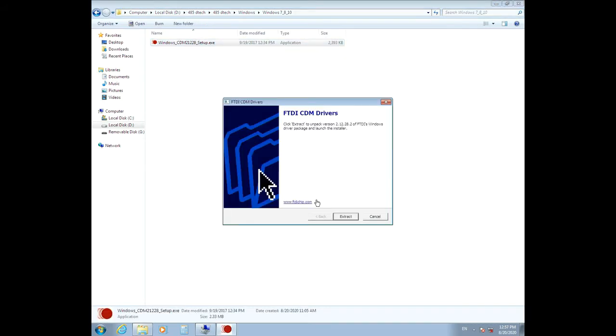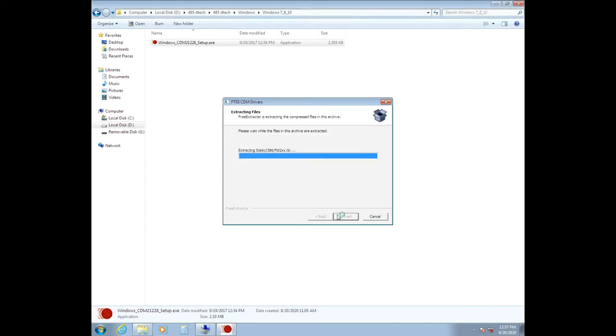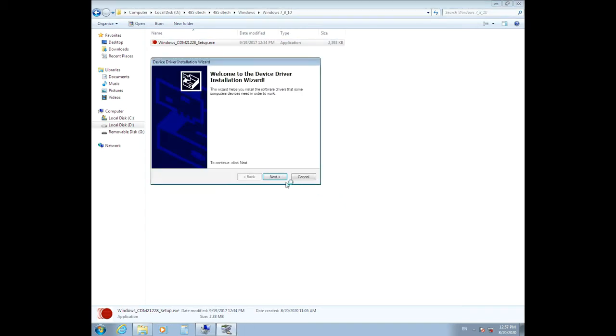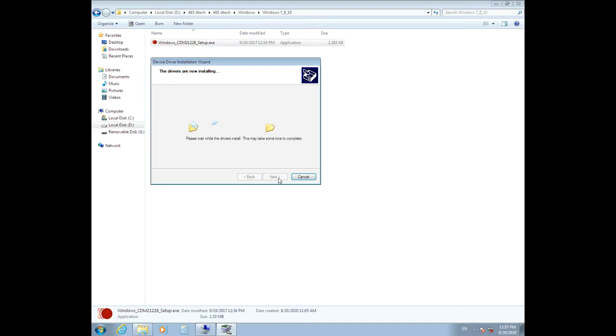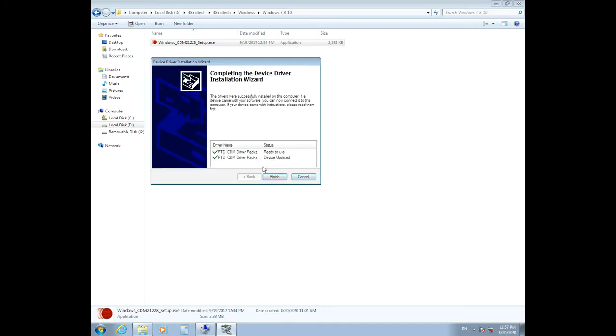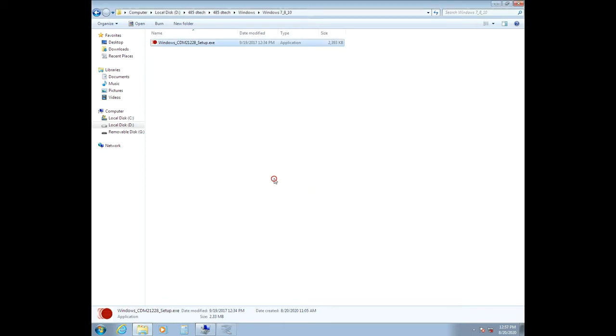Install the program easily. That's it. Your converter is ready to use and the device is updated. Click on the Finish button.